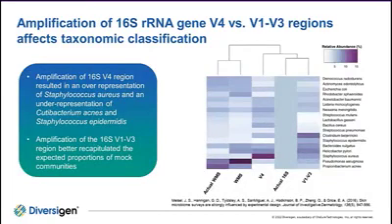Even though we have limited information on the effect of different annotation tools and databases on skin microbiome studies, we know that, as I mentioned, the selection of the 16S variable region can influence results. For example, this figure shows a cluster heat map of the relative abundances of a mock community composed of 18 different bacterial species. Results showed that amplification of the V4 region of the 16S gene resulted in an overrepresentation of Staph aureus and an underrepresentation of other species, including C. acnes and Staph epidermidis, as you can see here. More recent studies have shown that, in fact, if the primers targeting the V4 region of the 16S gene are modified, C. acnes can then be identified, and I'm going to be talking about that in a few moments. In addition, results show that amplification of the V1, V3 regions of the 16S gene can better capture the expected proportions of these mock communities.